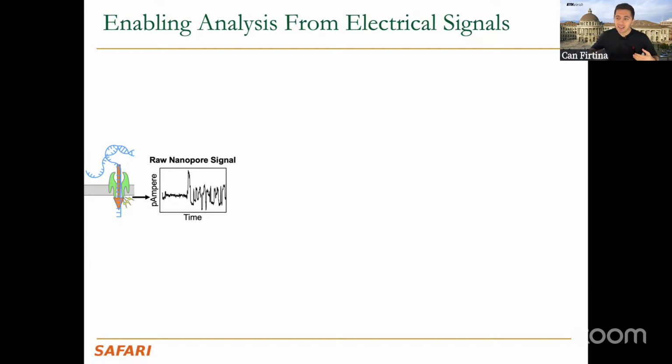So this is not simply the collection of the bases that you have in the nanopore, but their order is also important, because you can change the order. This means that now the base closest to the sensing head will be different, and also the distance of the other bases to the sensing head will be different, so perhaps you will generate different characteristics of the ionic current disruption. So these are the important factors here.